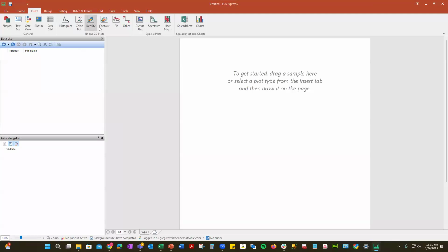Okay. So when you open up our layout, you'll see that it has this very familiar feel to it, right? This feel is like PowerPoint with the tabs here, kind of Excel. So it's really Microsoft-style, and it's done purposely to make it very intuitive to be able to work with.